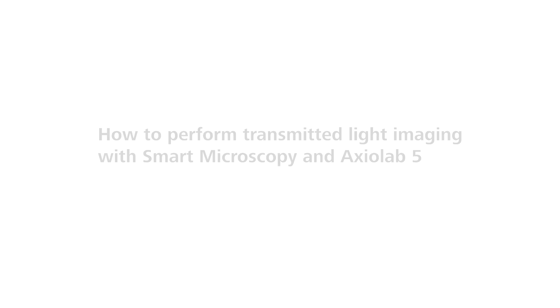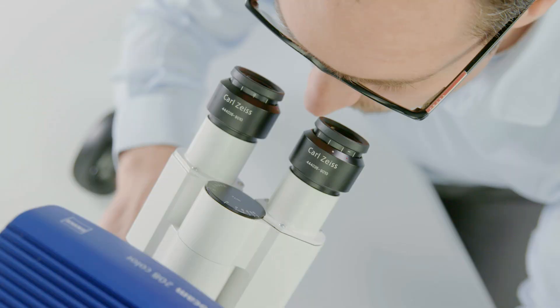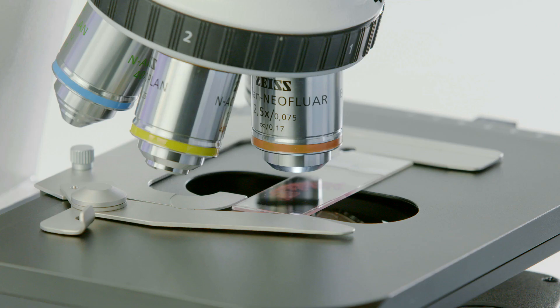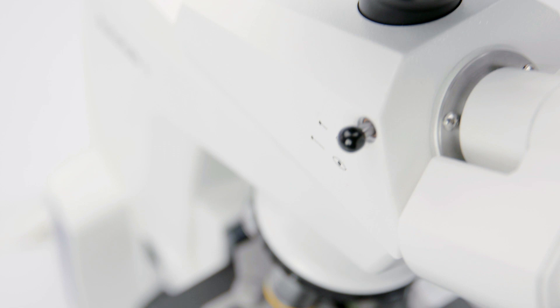How to perform transmitted light imaging with Smart Microscopy and Axiolab 5. Imagine acquiring images in transmitted light as you see it through the eyepieces, complete with the right scaling, using just your microscope without a PC. With Smart Microscopy and Axiolab 5 from Zeiss, you can do it all in one go.